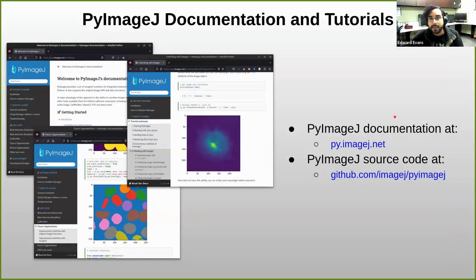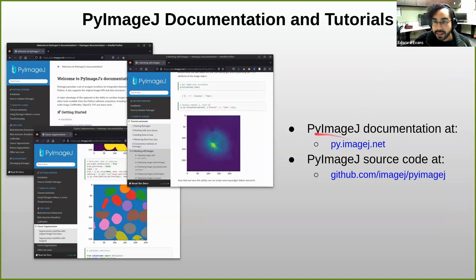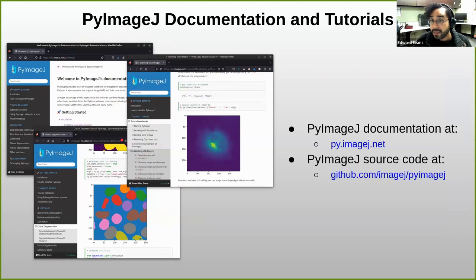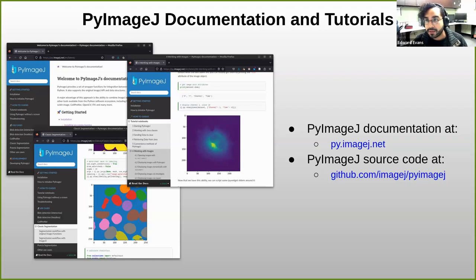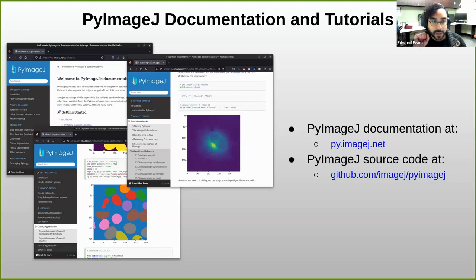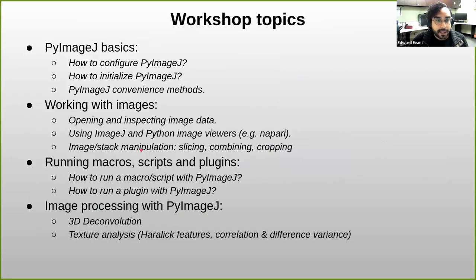The documentation and tutorials I'll talk about today are located at py.imagej.net. You can see snapshots from that site, and the PyImageJ source code is at github.com/imagej. Inside that repository there's a doc folder where all the notebooks we'll look at today live. If you grab a copy of that repository, spin up an environment, and install a couple of packages like scikit-image, you should be able to run the same workflows we'll go through today.